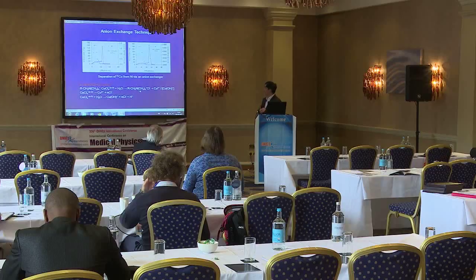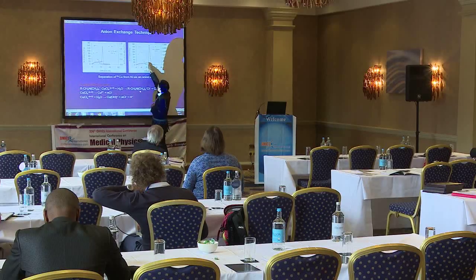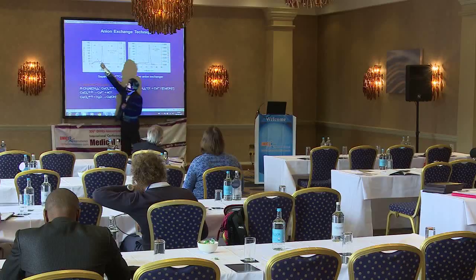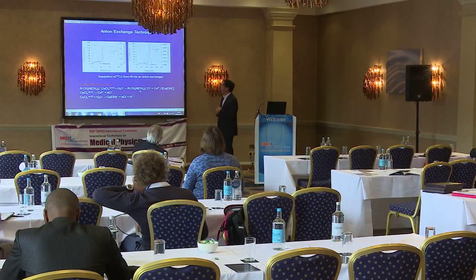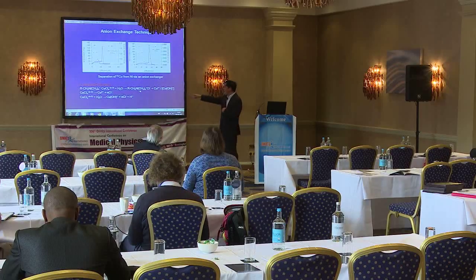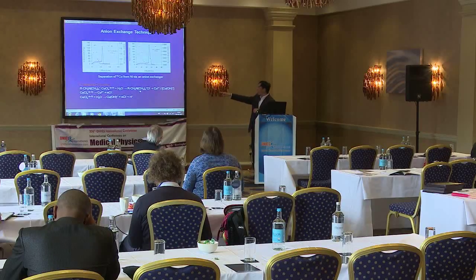So here is a profile for the radioisotope separation. We have two paths here. From this point, we change the solution. It's the same from here, same from here. Before that point, we use highly concentrated hydrochloric acid to strip the nickel out. The blue squares are the nickel coming out. After the nickel comes out, we change to water. Because when we add the water, from the reactions here, the copper chloride complex will dissociate into copper ions.